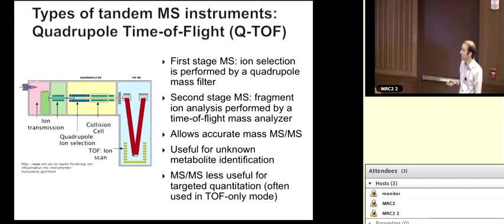We've got 2 GCMS systems, 2 GC flame ionization detection systems, which are used for certain lipidomics type assays, and some automated sample handling equipment, additional sample prep resources, and support equipment. So you'll get to see some of these fun machines when you walk around the lab in a couple days if you haven't already. But suffice it to say, we have the equipment to do the assay that you need to do if it's metabolomics here.